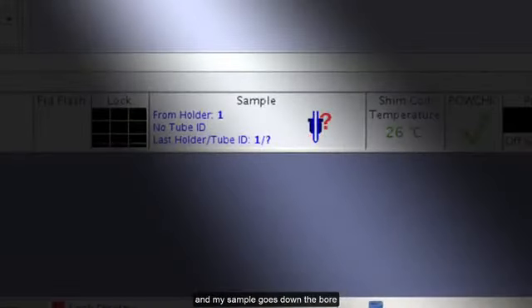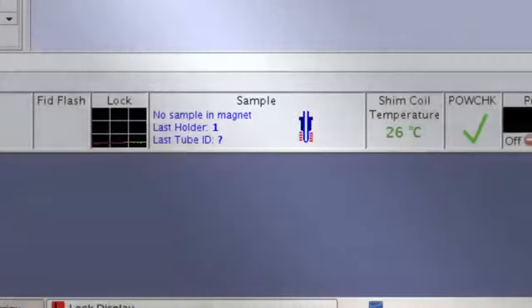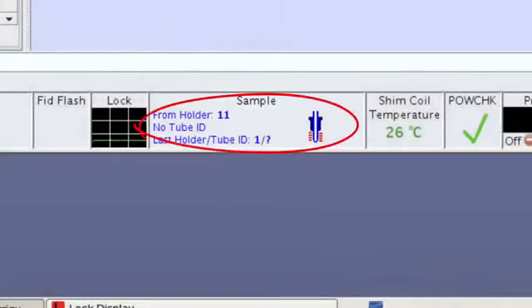The computer processes the FID using the FT algorithm to produce the spectrum. 1.5 Overview of NMR applications in chemistry and biochemistry. Structure elucidation. Primary application: determining the covalent connectivity and stereochemistry of organic molecules, natural products, and novel compounds.